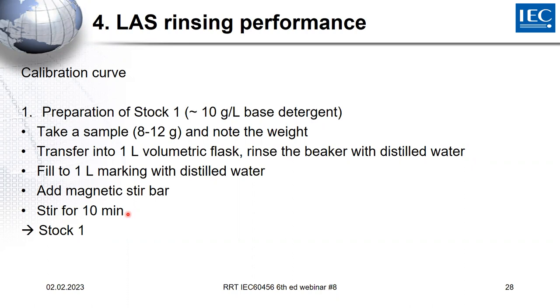You will see that the solution will not be a clear solution. You will still see particles. This is very normal, because the base detergent will not dissolve 100%.